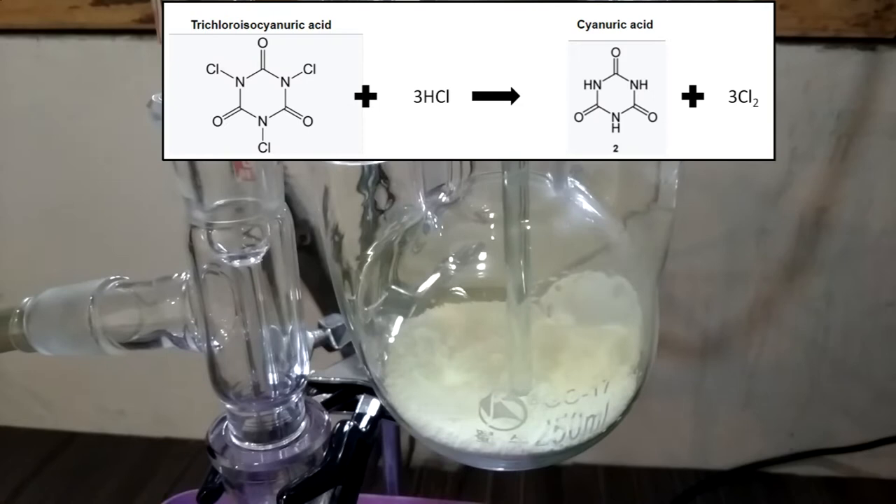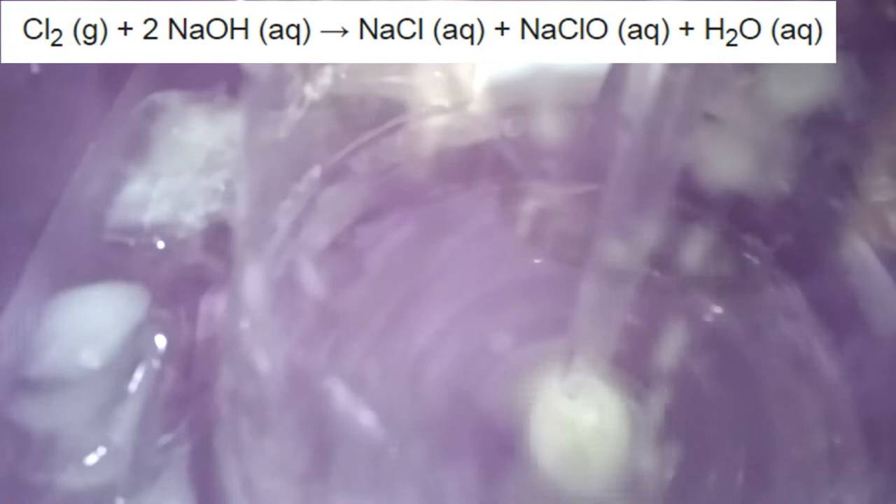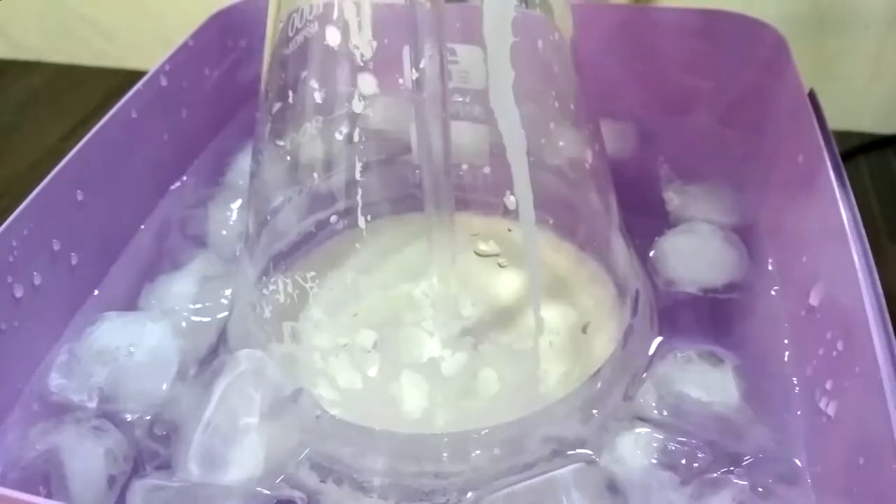Let's get started. Hydrochloric acid is added and some greenish-yellow chlorine gas is coming out. In the Erlenmeyer flask, we can see some white precipitate forming. Sodium chloride has good solubility in water, but in concentrated sodium hydroxide its solubility is so poor that the precipitate forms almost immediately when the reaction starts. After a few minutes, the mixture turns into a slurry and gets thicker and thicker. I used my larger stir bar so it worked just fine.